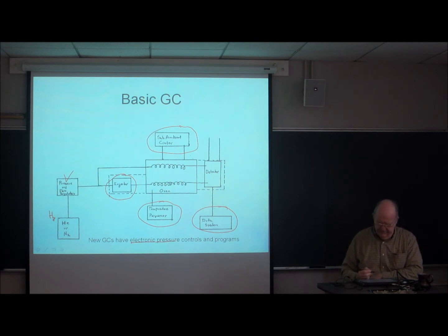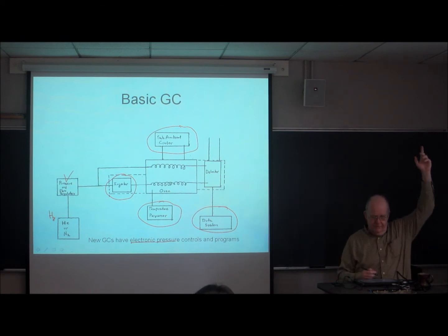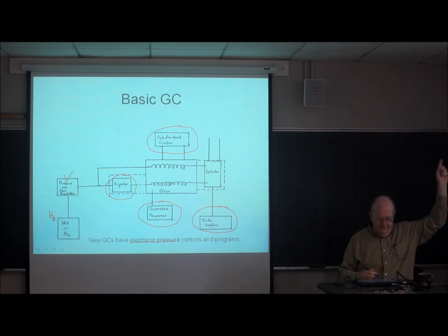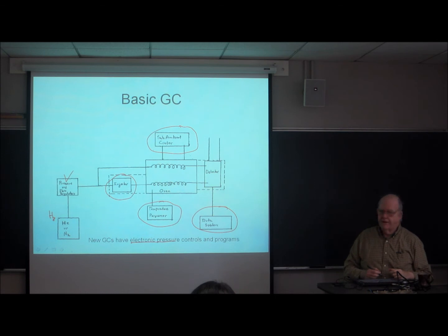If you're doing preparative scale gas chromatography, you need a bigger instrument, bigger columns. Prep scale GCs I've seen as big as the height of this room, would take up a significant fraction of them. They're expensive.